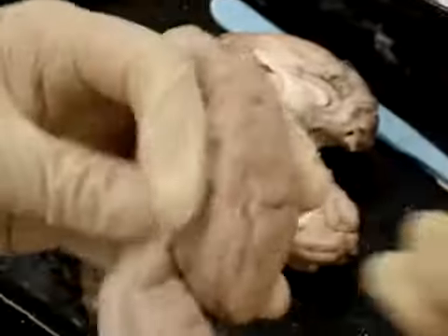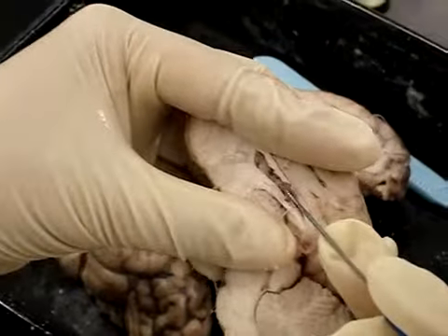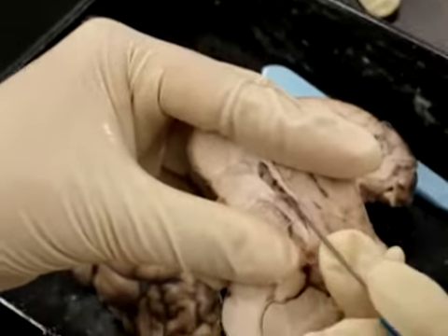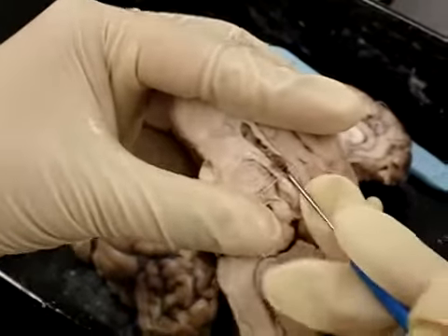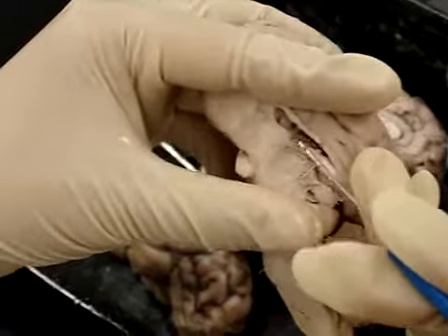And choroid plexus can be located inside the ventricles. It's this dark brownish colored thing, and so it's located in all the ventricles, and it produces cerebrospinal fluid.